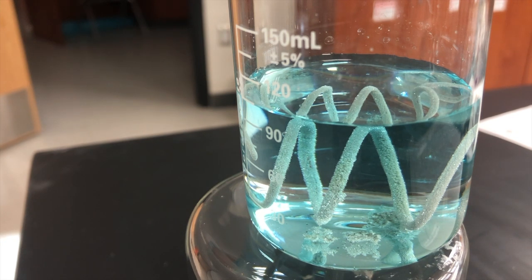Now, the copper wire is reacting with the silver nitrate in solution. So as our silver is forming, that's our beautiful little sparkly fuzz going on there. That's our actual silver that's being pulled out of the solution. The copper wire is getting covered, and as it gets covered, it can't react anymore.